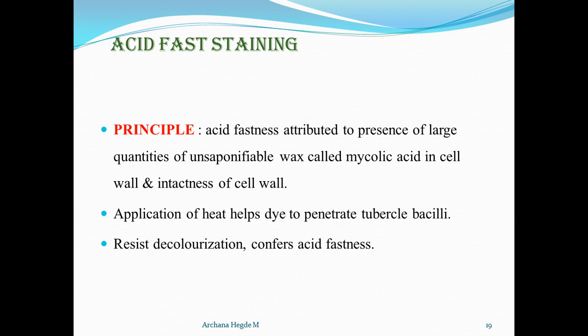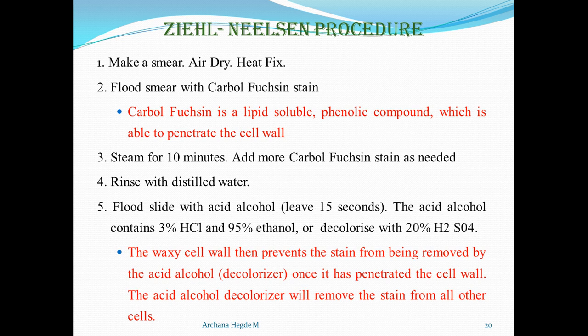Here tuberculosis bacilli resist decolorization. So when you pour the alcohol or a decolorizing agent, the decolorization doesn't happen. So hence the acid fastness is seen. Whereas non-acid fast bacilli will not resist this decolorization, hence the blue color is seen.